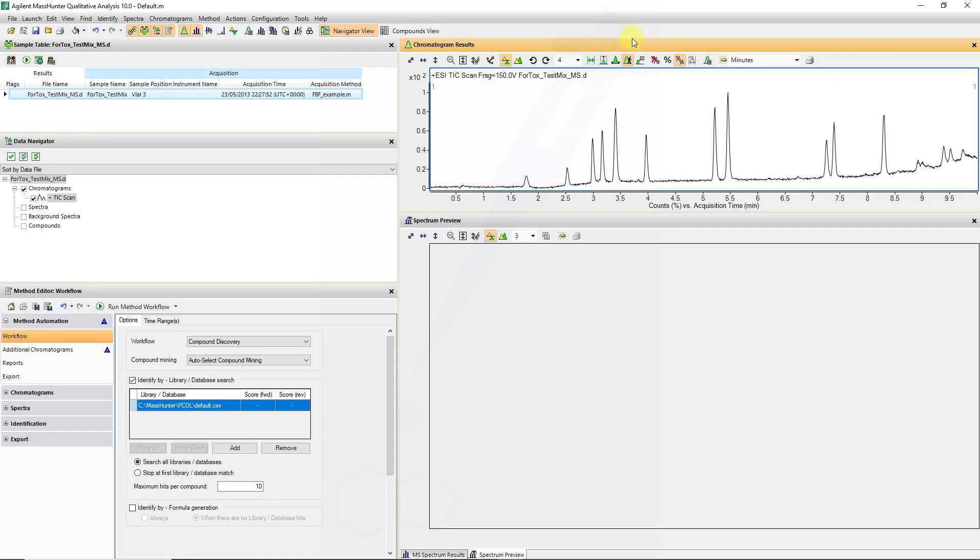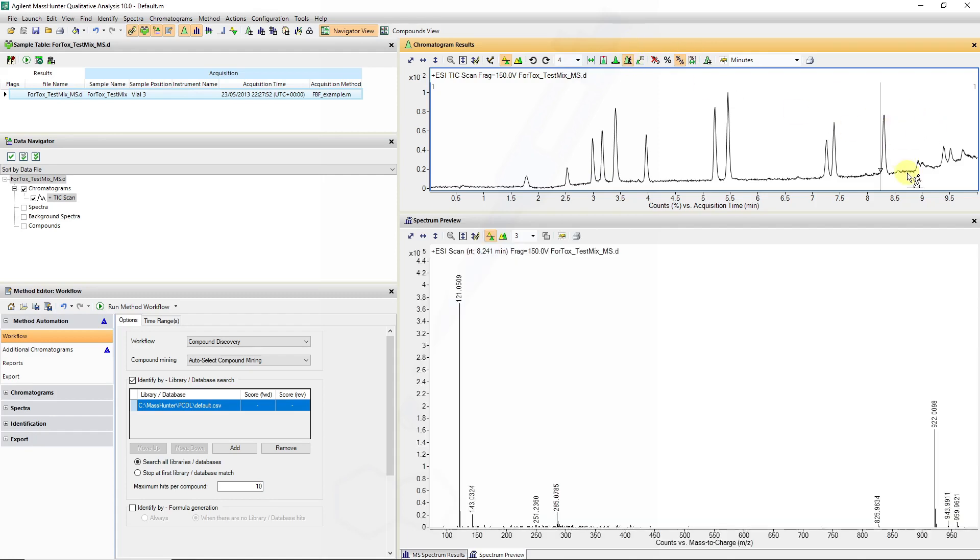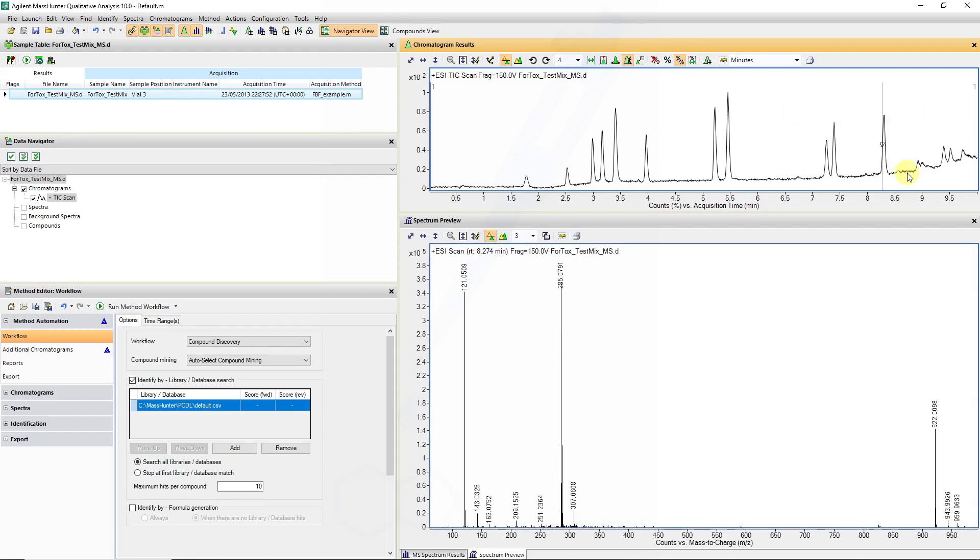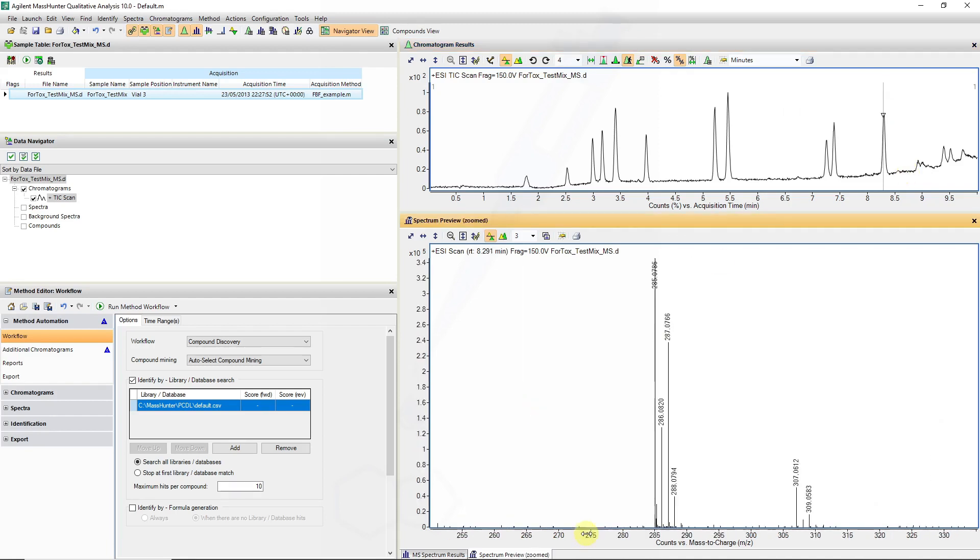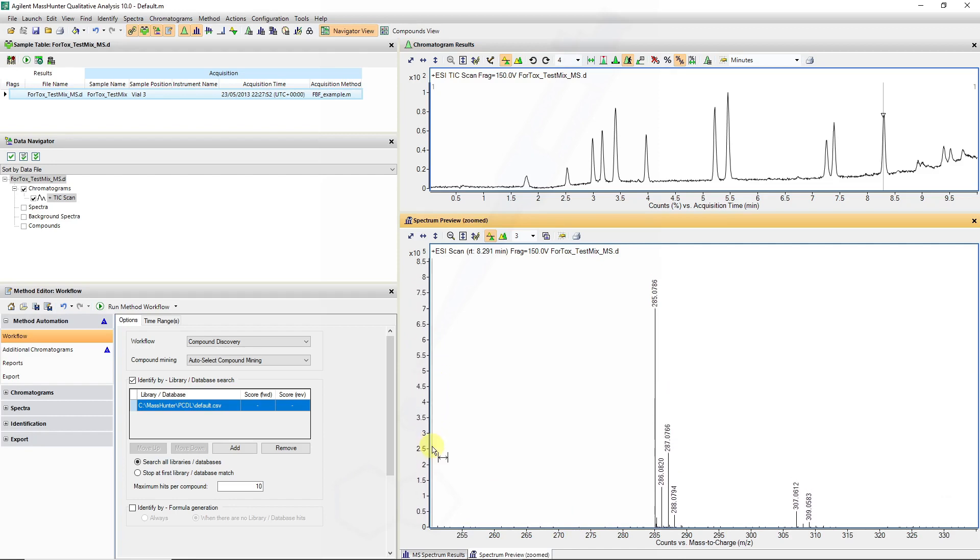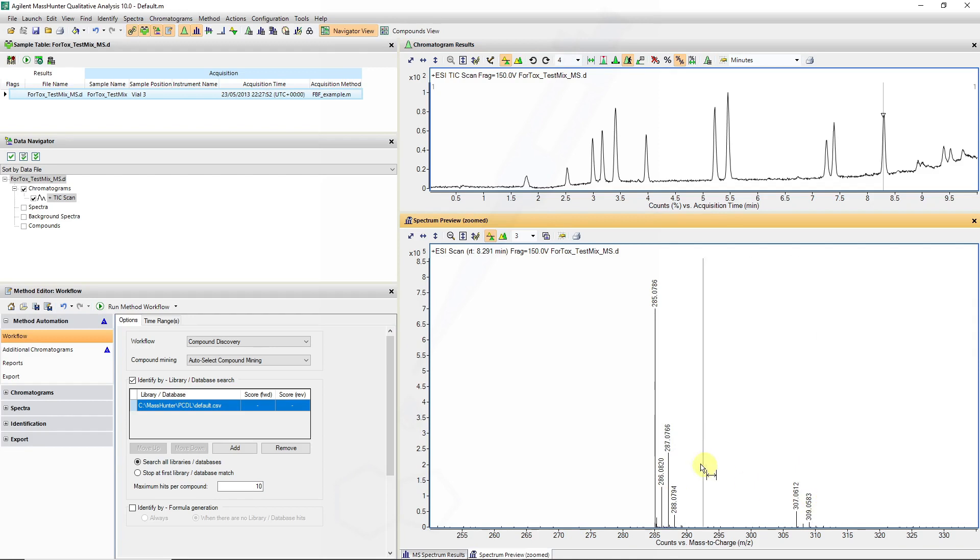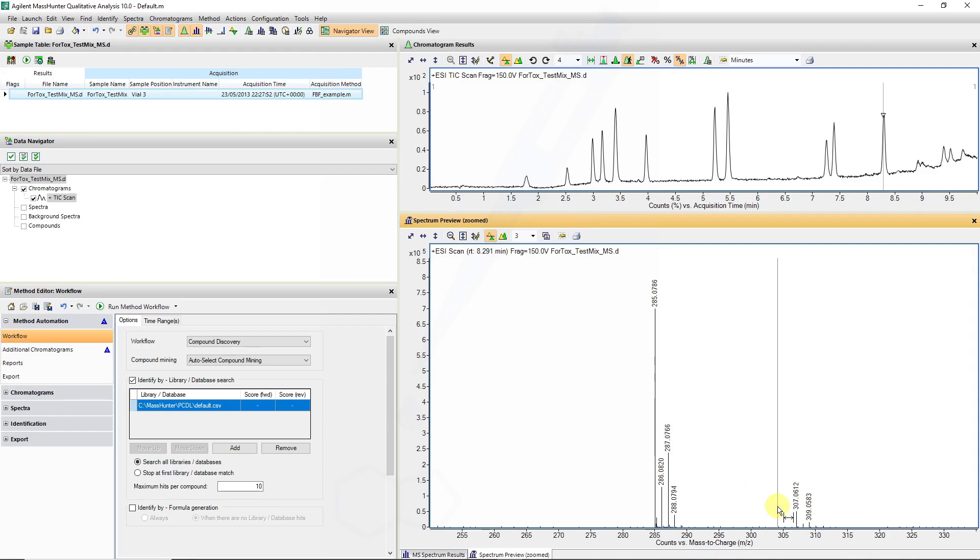I'm going to use my chromatogram tool again, left clicking on there, and just place my cursor on this peak at 8.3 minutes. Recall we saw an isotope cluster which is characteristic of chlorine. We could also see a potential sodium adduct, which is 21.98 Dalton on.